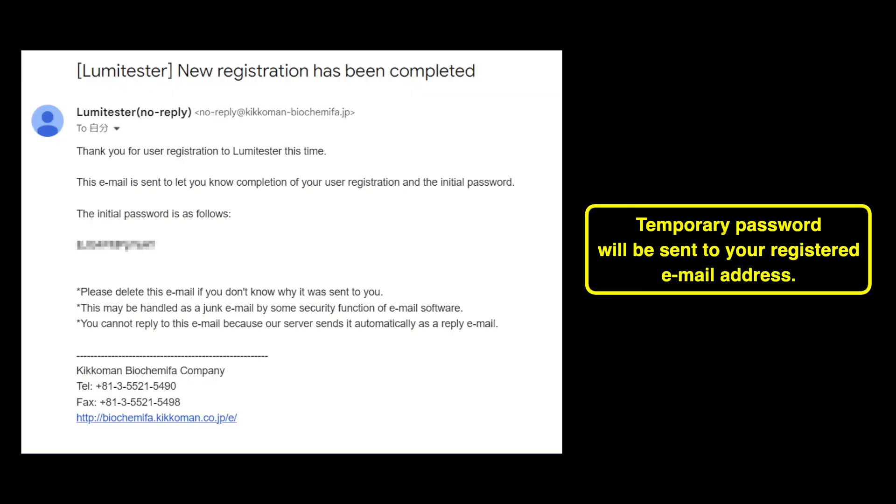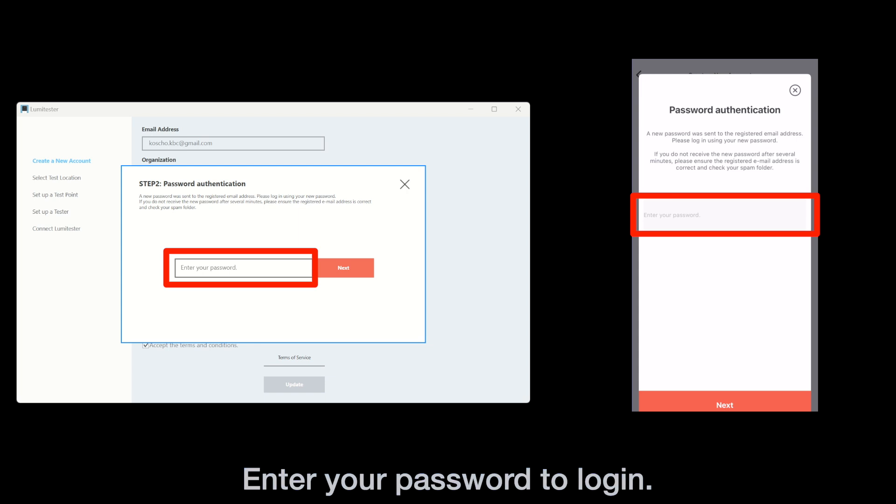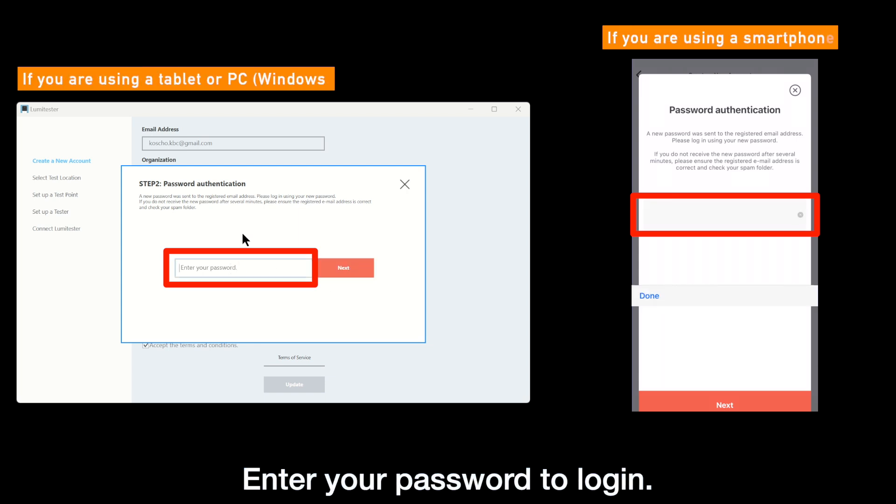After registration, a temporary password will be sent to your registered email address. Please enter your password to log into your account. This password can be changed from the app settings anytime.